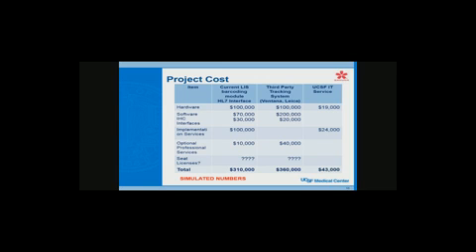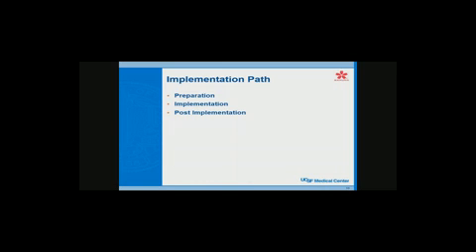And then the third part you have to think about is your internal costs. If you're a large institution like UCSF, we have our own IT department. We could have them do work for us, but they recharge us for it. So, there's some things that they charge for, either planning or things like determining, testing items, implementing things, all kinds. They charge for all kinds of things. So that's another thing you have to think about. So that's the money side of it, and it's good to try to get in a reasonable ballpark before you start asking for the money, so you're not surprised later on.